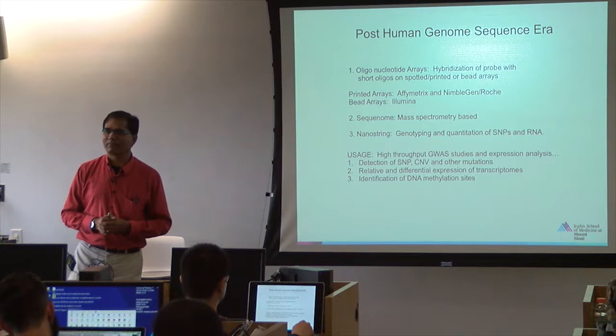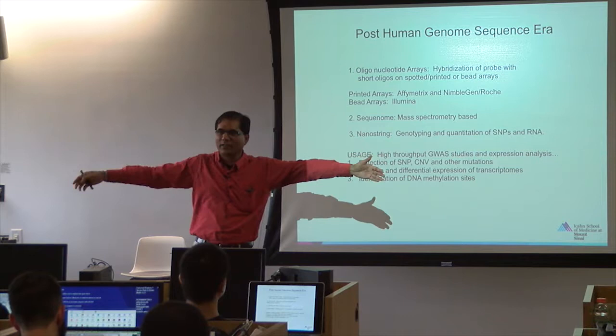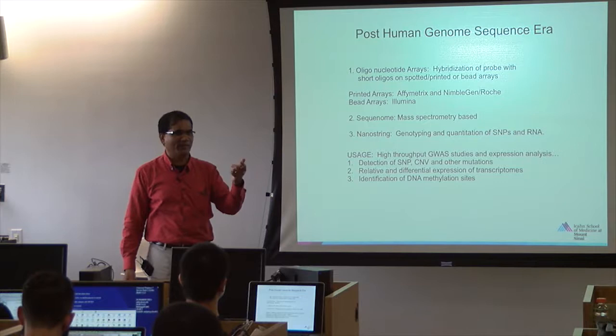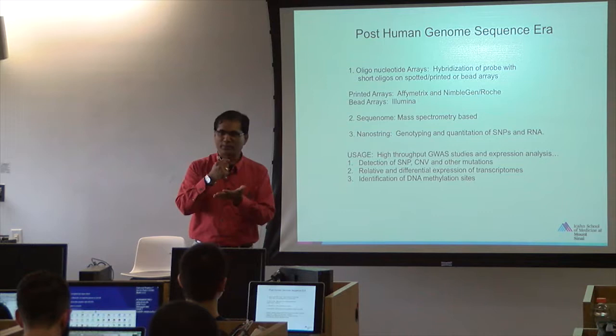Right? So what we can do in the microarray technology is break that entire 3 billion bases of the long strand, or 6 billion bases, the copy of those, into small portions. Another technology, called the chemical synthesis of DNA, was available. Those technologies were developed. And then chemically synthesize each part of that entire human genome and then put them as a spot on a chip.